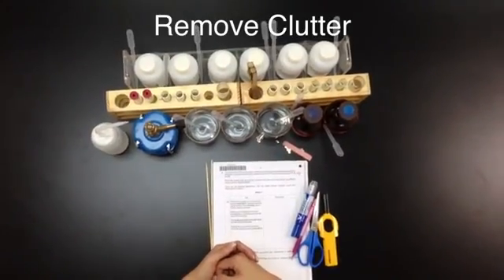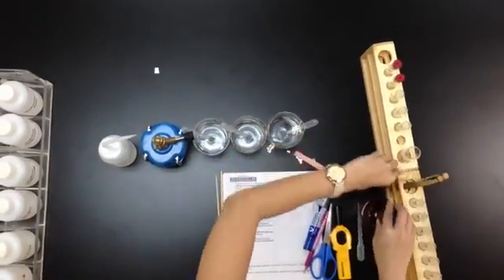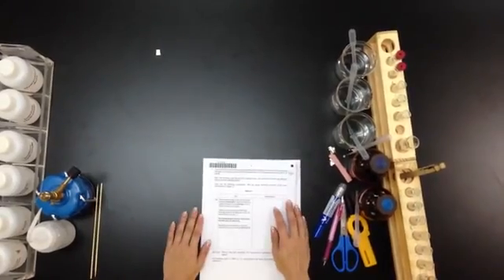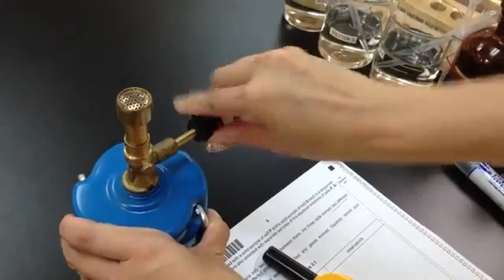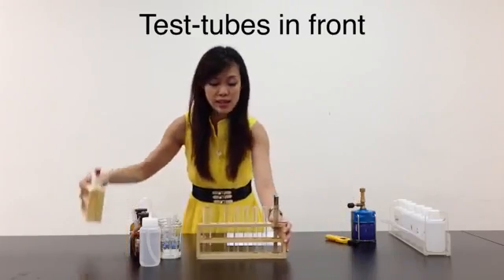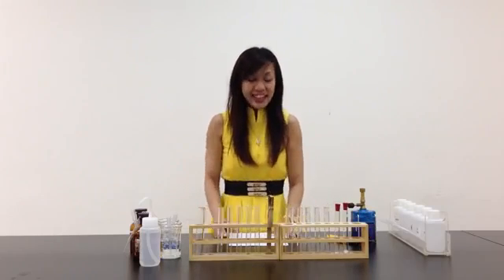Let's clear the clutter first. My clutter is clear. I always like to test my Bunsen burner first before I start any experiment. Let's see if the lighter is working. Test the Bunsen burner — everything is working well. Let's put this aside. I like to put all my test tubes right in front of me so that I can access them easily. Let's read the experiment.